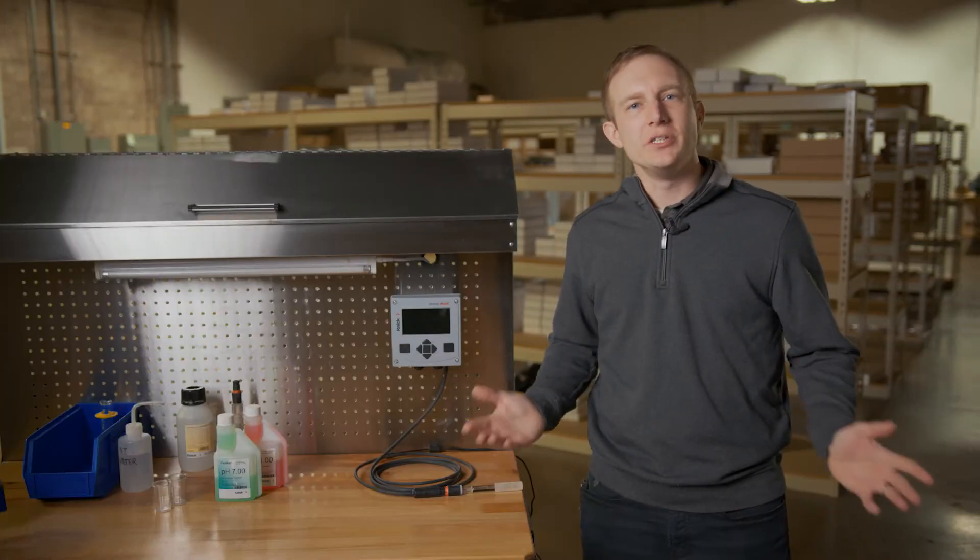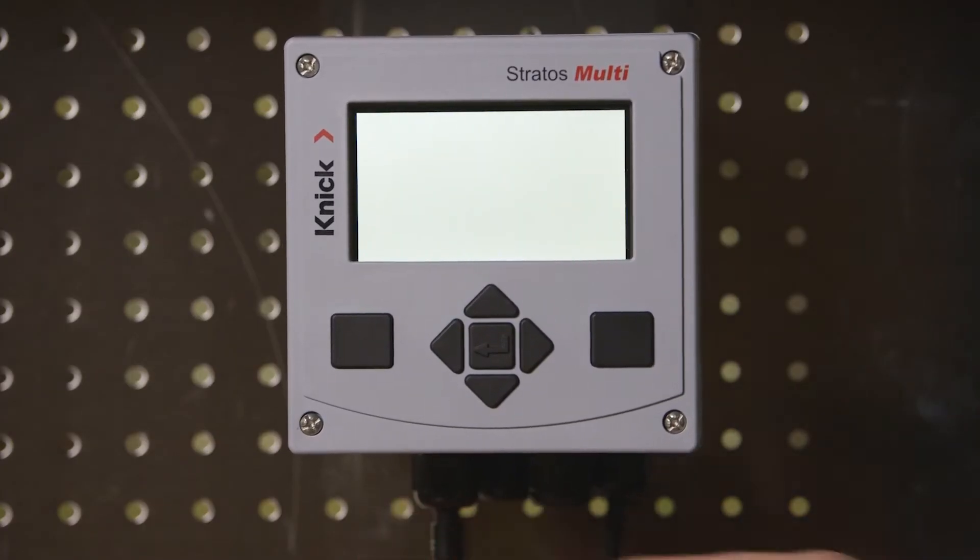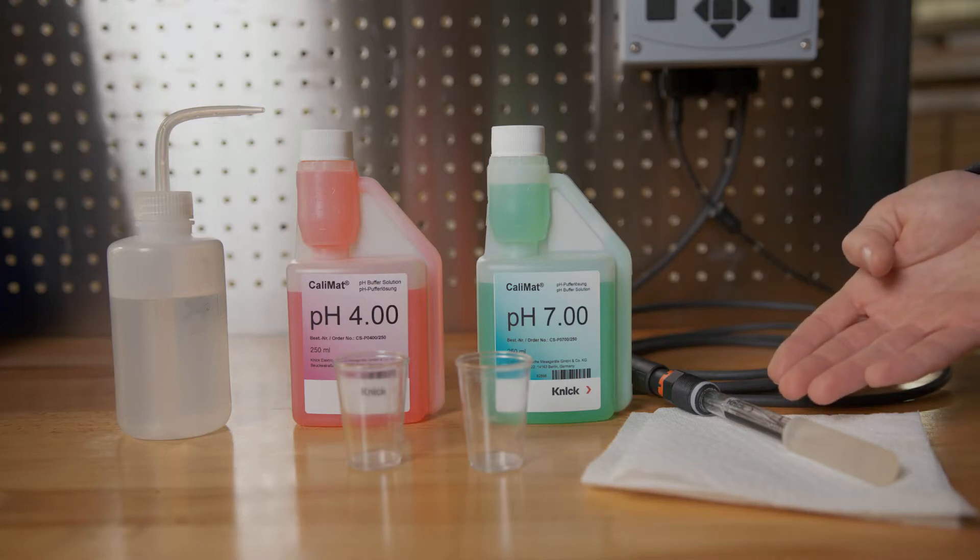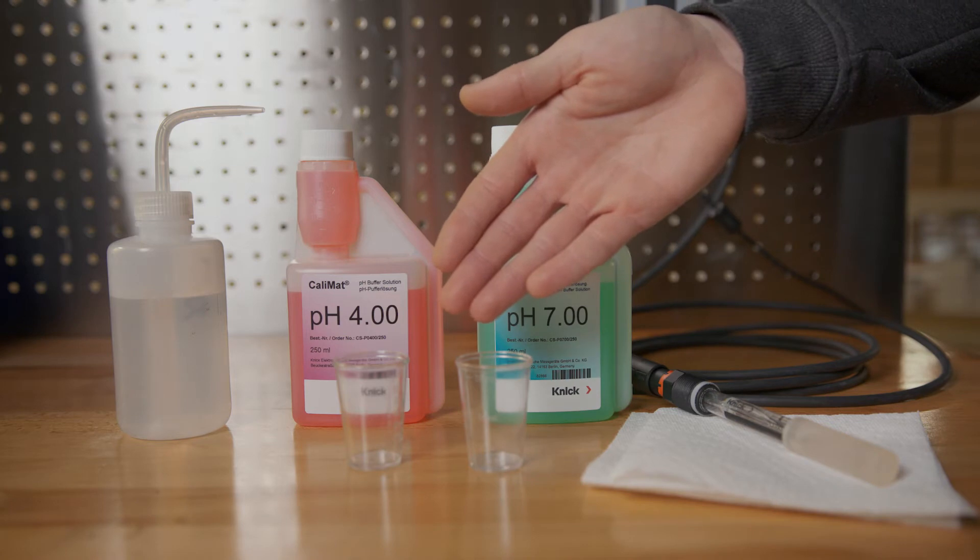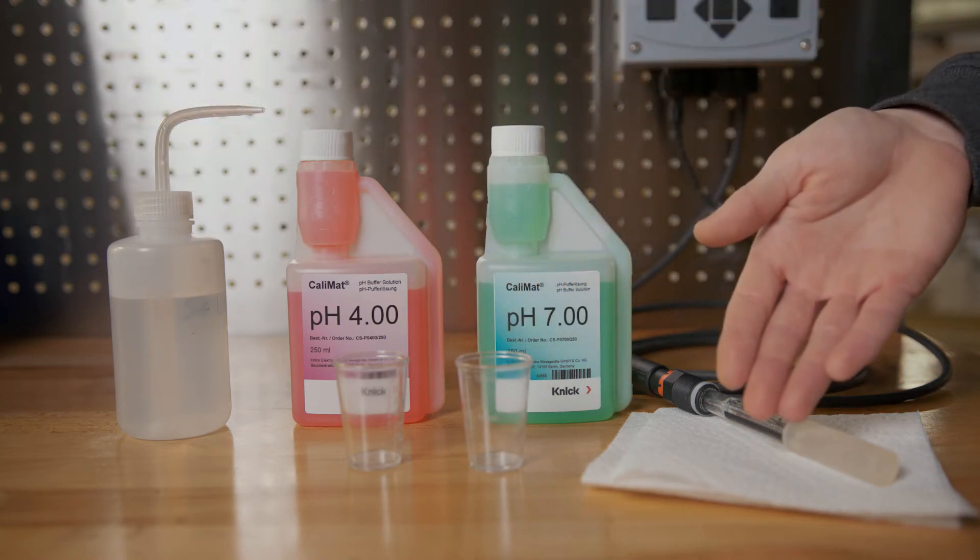To perform a calibration you will need a Stratus Multi transmitter that has been powered up with a MemoSense cable connected, a MemoSense pH sensor, at least two buffers with clean containers to pour them in, rinsing water, and a clean cloth to dab the sensor dry.